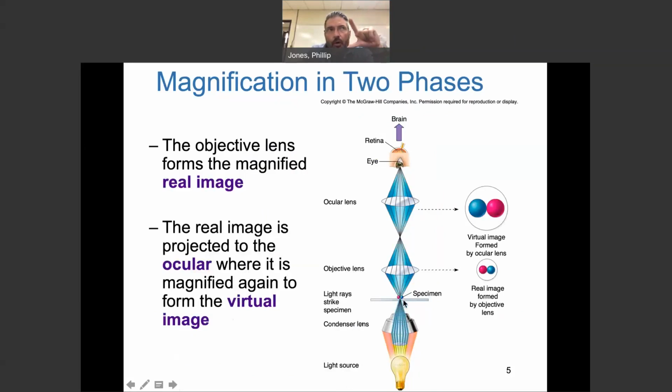The other thing, remember, thankfully, one person had their slide upside down. Everything came into focus really well until you got to oil immersion. Then no matter what you did, it wouldn't come into focus. I said, I bet you the slide is upside down. We looked, and sure enough, the label was facing down. So you want to make sure that your sample is superficial, closer to your eye. If it's flipped over, it won't come into focus with the oil immersion.